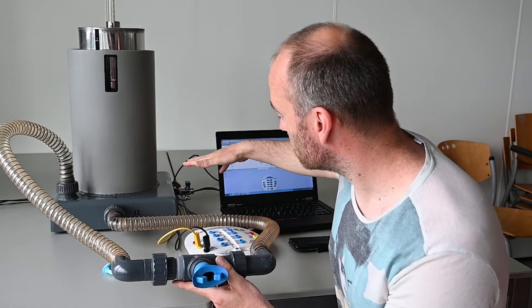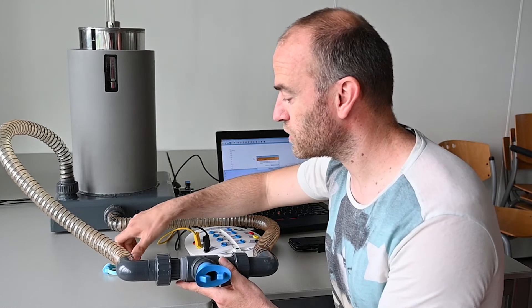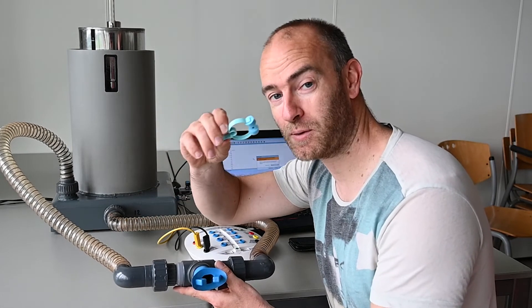The whole system is connected via Coach Lab to the computer, through which you can register your experiment. To start your experiment, you also need the nose clip to put on your nose.